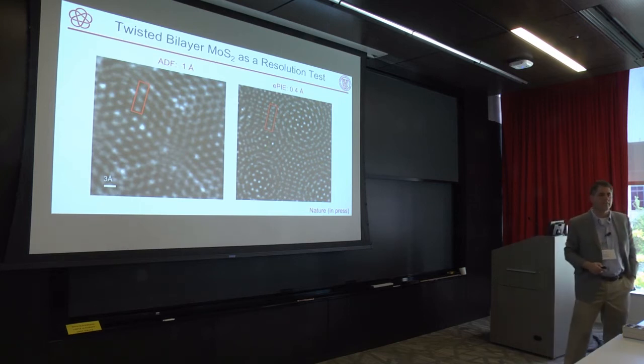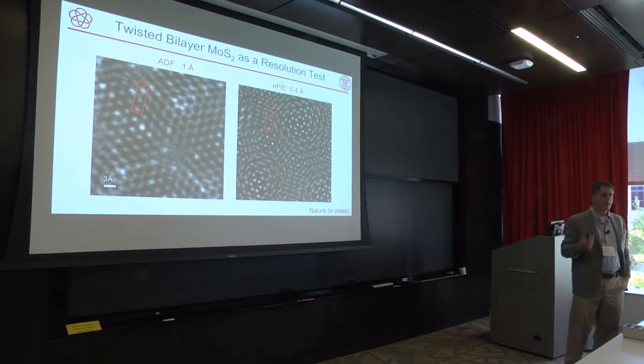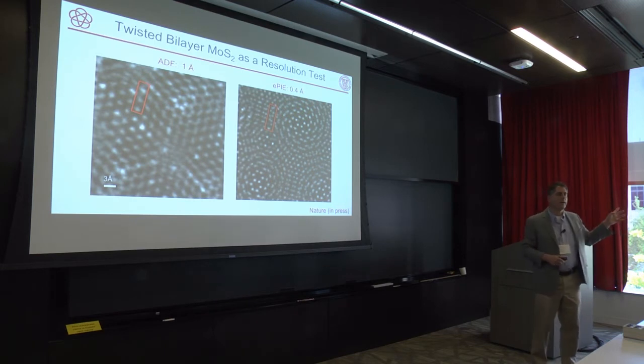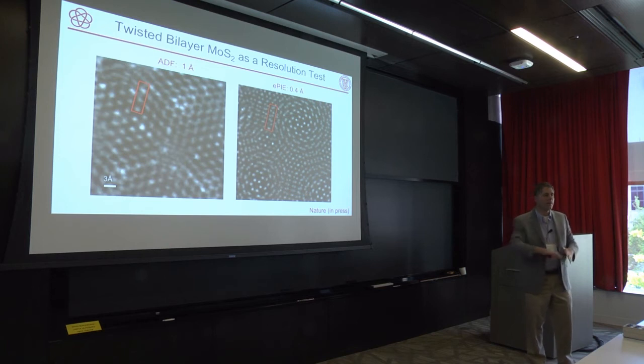So it's not just, is there an atom, but where the atom is can have subtle physics: charge density waves. Exactly. So that's the stuff that Leno works on. If you put one of these materials in and you cool it down, and you now have a charge density wave, what the electron microscope tells you is where is the nucleus, right?